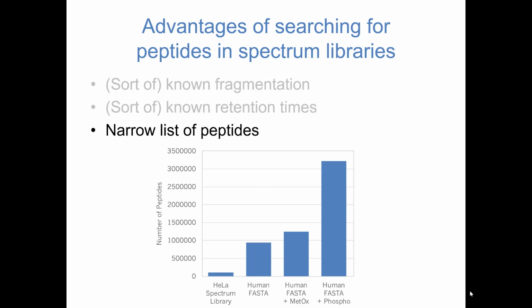People have seen this sort of issue with DDA analysis, but here it's a much more significant issue relative to looking for those individual libraries. So a library of phosphopeptides is very valuable, I think, for those sorts of experiments, rather than trying to go blind and just look for fragment ions associated with random potential phosphopeptides.